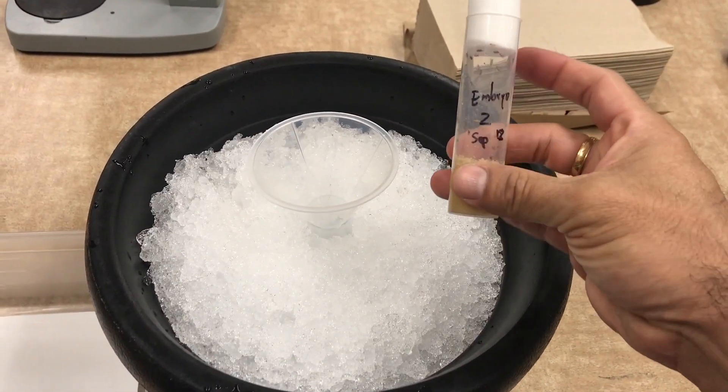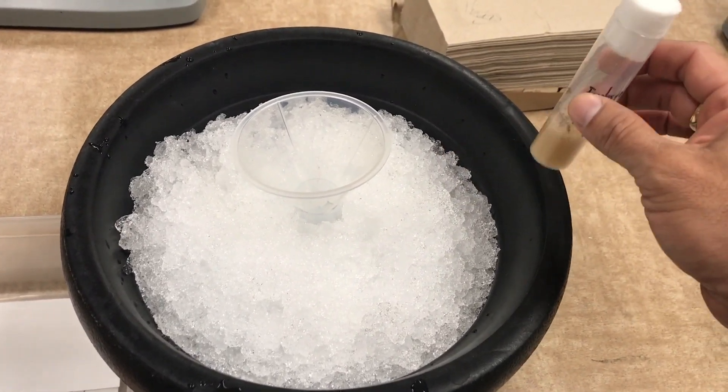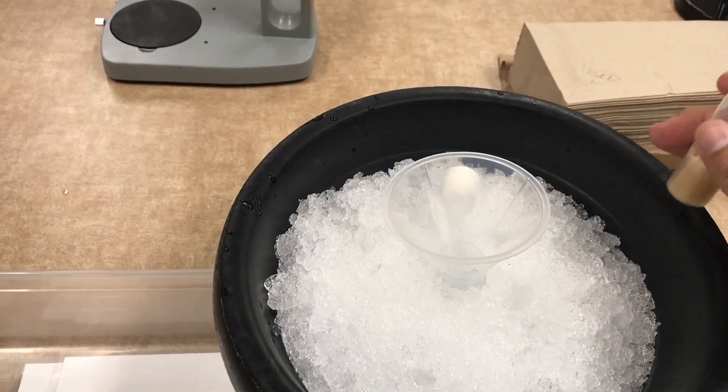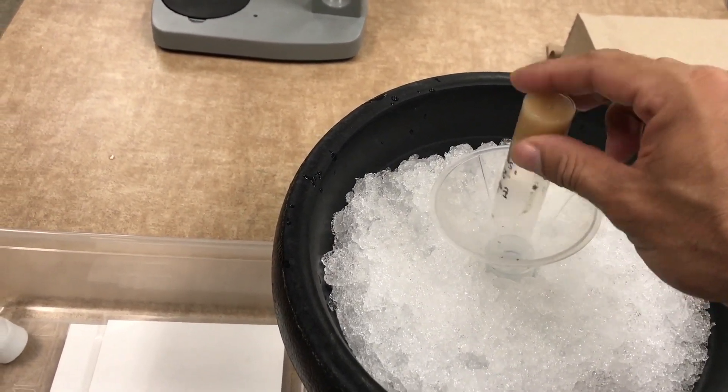This is the tricky part. You have to take your flies and tap them carefully so they can go to the bottom of the tube. Remove the lid and tap them within your new tube that is cold.